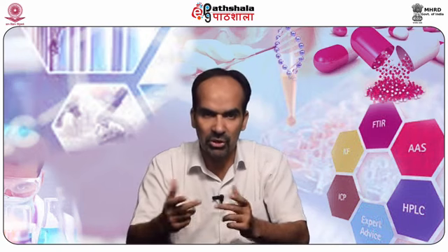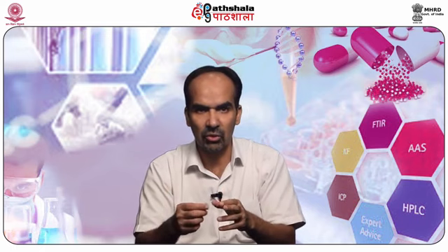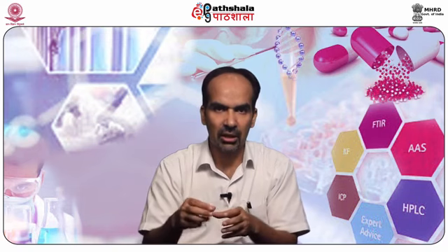The procedure goes like this. A weighed quantity of orthocresol and oil, which is previously dried with calcium chloride, is melted in a test tube, which is then fitted through a cork into a bottle, which acts as an air jacket. As the temperature falls and crystallization begins, the contents of the tube are stirred vigorously with a glass wire stirrer. The temperature rises again. The highest point reached, which is read through a thermometer, is taken as the freezing point.